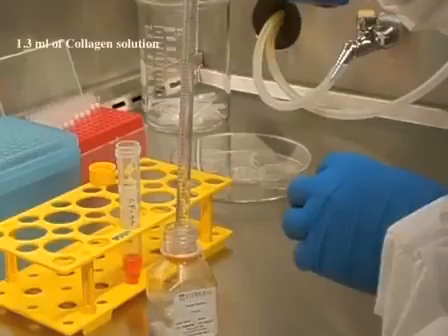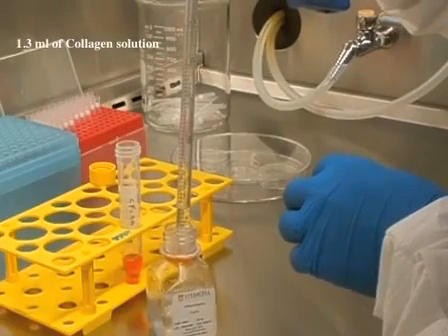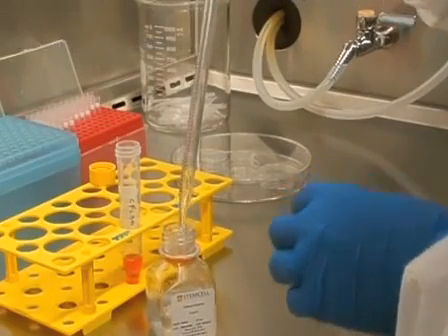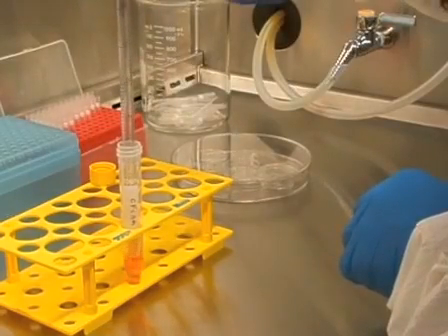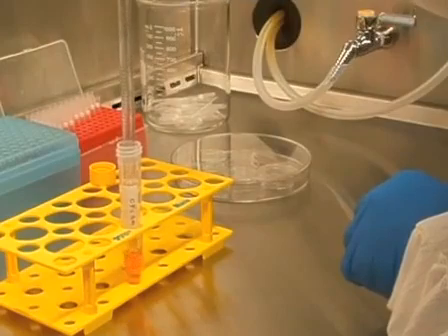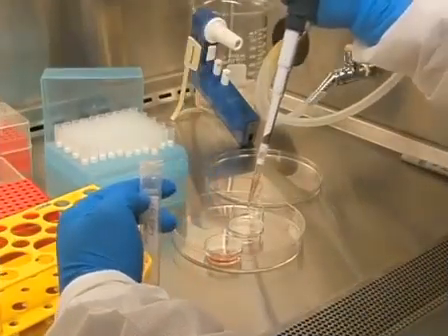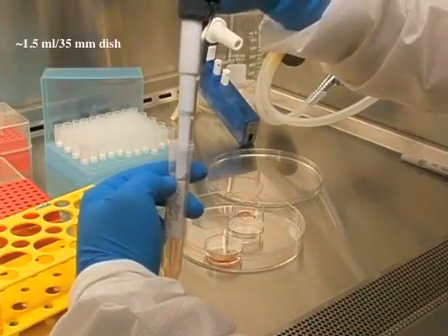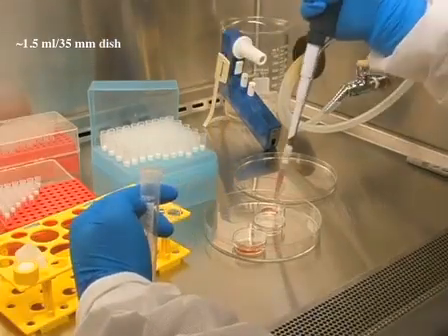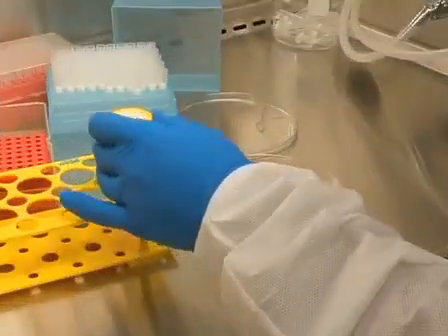Add 1.3 ml of cold collagen solution to the cell suspension and mix well, but gently to avoid introducing air bubbles. Then dispense the mixed solution to the center of each culture dish, approximately 1.5 ml per dish, and let the mixture spread evenly over the surface of the dish.